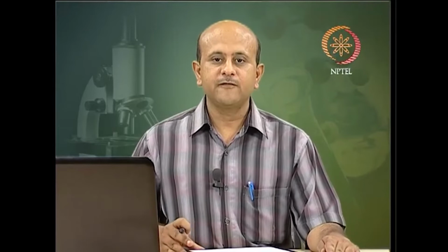Before we go into details, I would like to show you on your screen, in a very simple way, the mechanism and working of ion exchange chromatography. So, please focus on your screen and let us understand this whole ion exchange chromatography, and then we will go into the details. So, the first thing is you have a stationary phase.